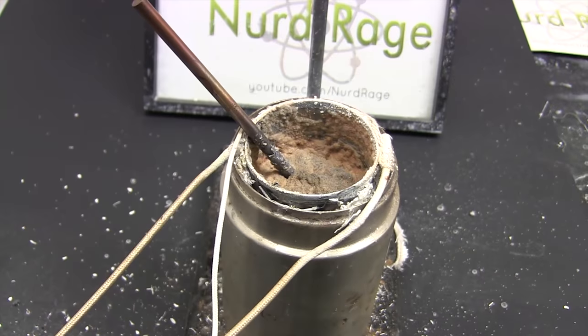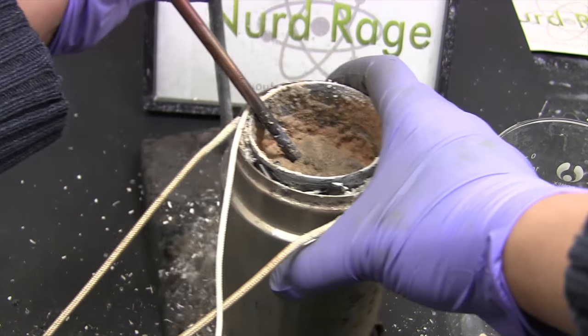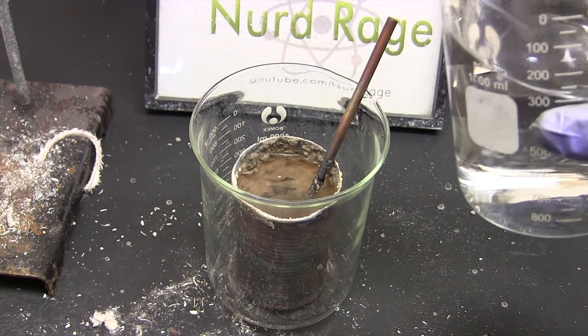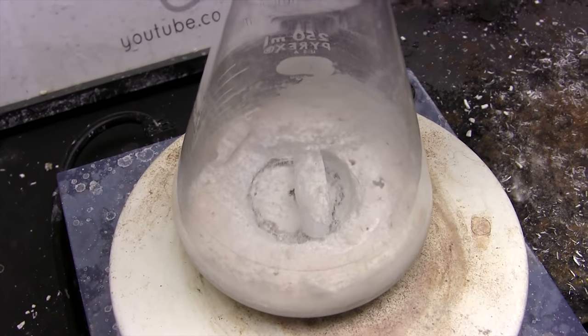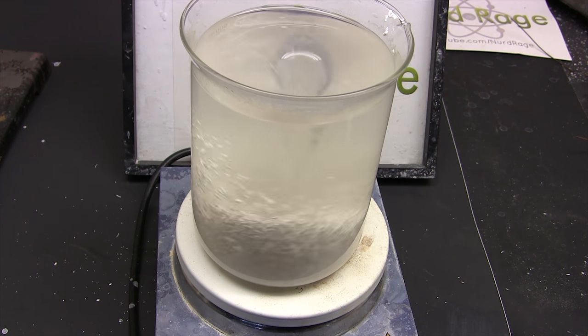Now first, let's consider a common lab issue. You have a mixture of chemicals that you want to separate. The answer is usually to find a solvent that one dissolves in but the others do not. Filter it out and distill the solvent and now you've separated them. But what about the case where you're separating insoluble from very slightly soluble compounds?